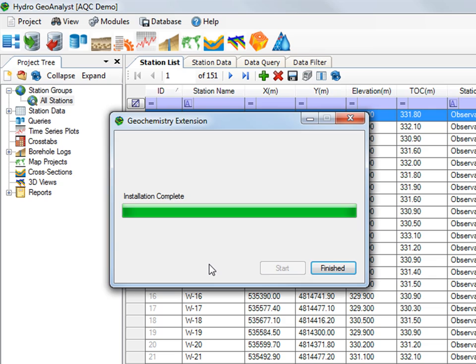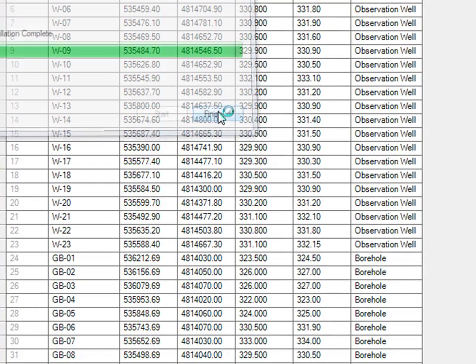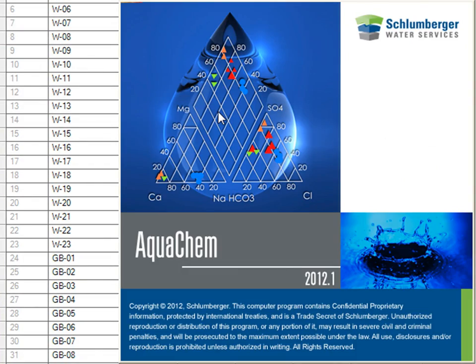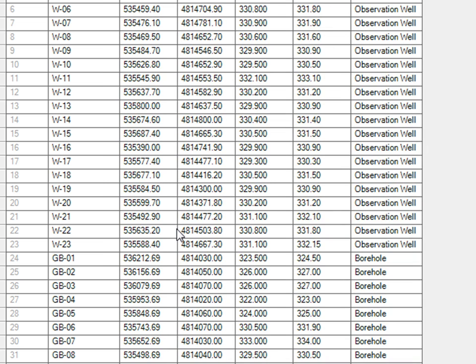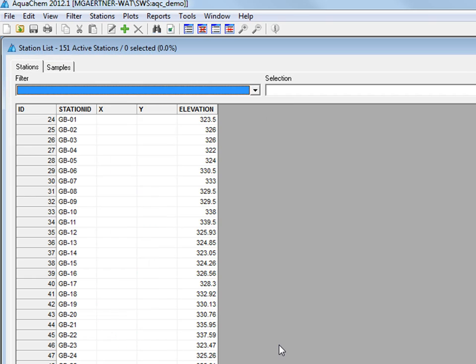When it's completed you select the finish button and you'll notice that AquaChem will launch. Once AquaChem launches it will load the project with all of your stations in it.